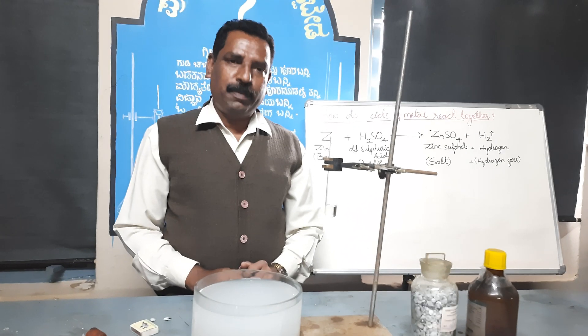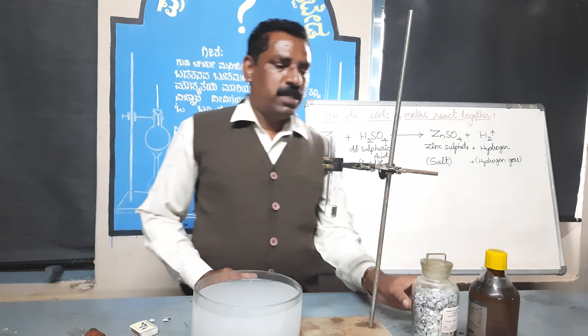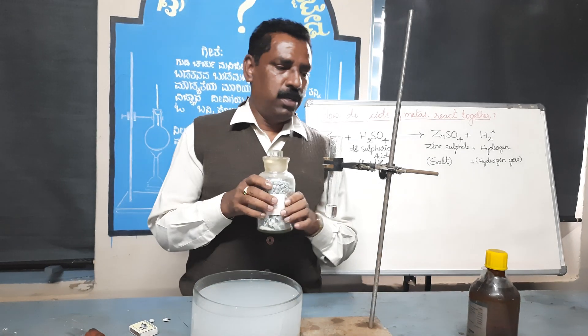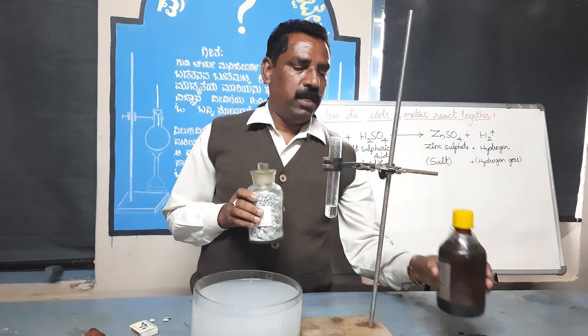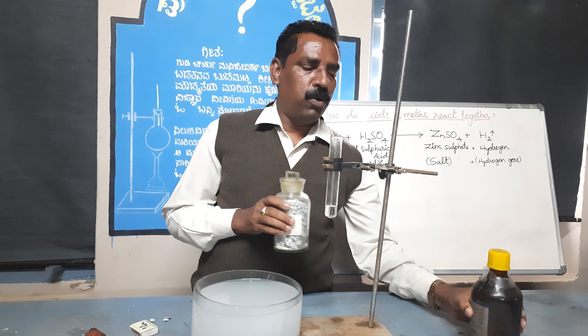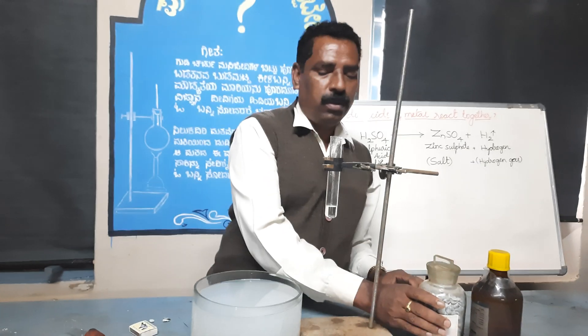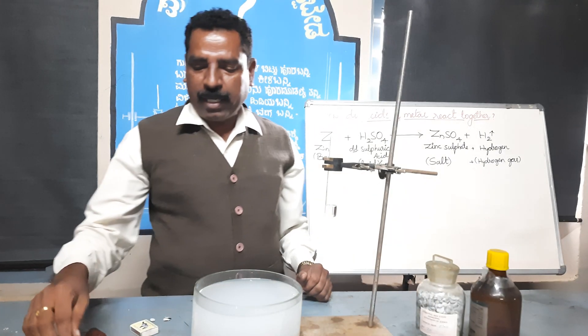For this experiment we need zinc granules, sulfuric acid — we have to make it dilute — and apparatus.